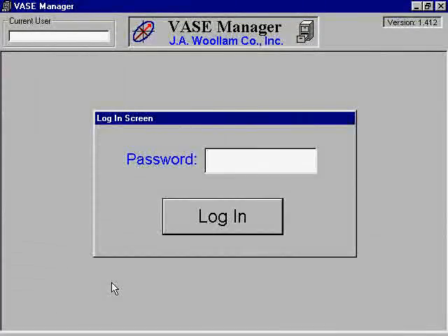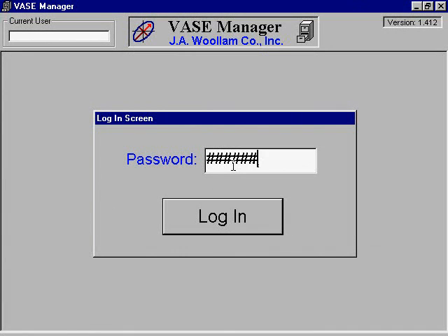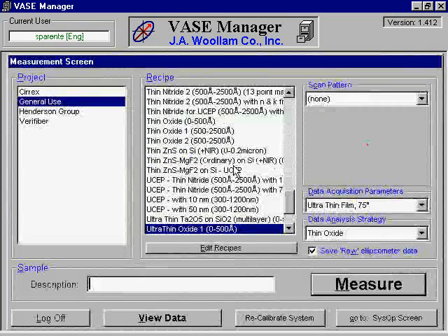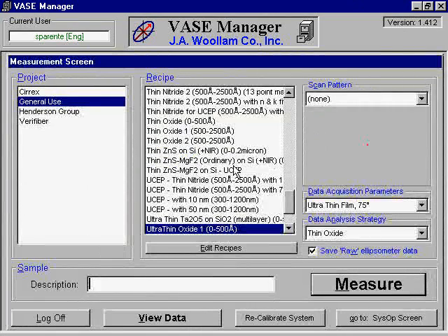The next step is to type in your user password on the computer. If you do not have a user password, you will need to contact the MRC staff. Once you have successfully logged in, your username should appear in the top left corner of the monitor.